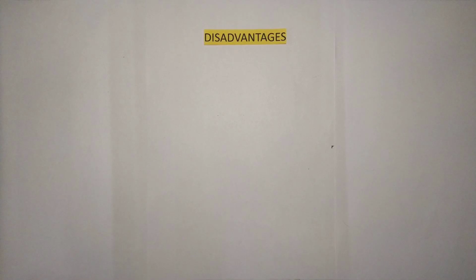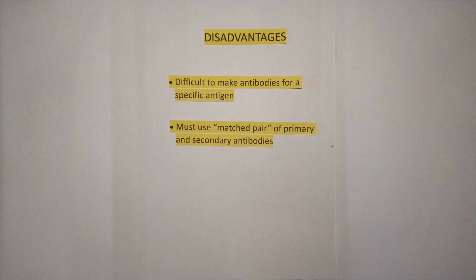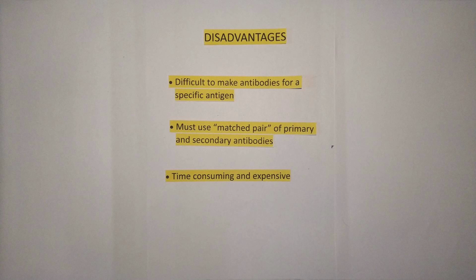Next, we'll see the disadvantages of sandwich ELISA. First, it is difficult to make antibodies for a specific antigen. Second, you must use a matched pair of primary and secondary antibodies. Third, it is time consuming and expensive.